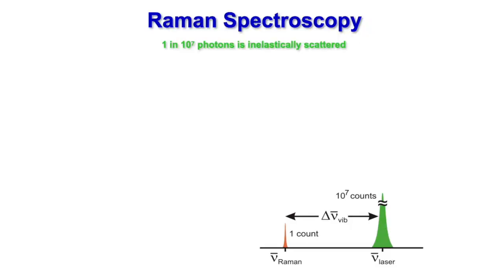Today, we can actually see one photon. If one photon comes, I can detect it. It's called photon counting mode, and today detectors are there which can detect. And that's why Raman has become very powerful. And today Raman is used in every field. Out of the number of papers being published, whether it is chemistry, physics or biology or any other area, nanotechnology, any of those things, Raman spectra will be there in the paper. You can do a simple Google search on this, and you'll find that 70 to 80 percent of the papers will have Raman spectra. So it has become a household thing.